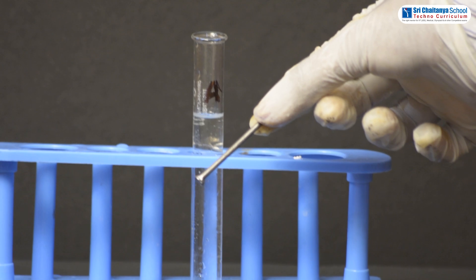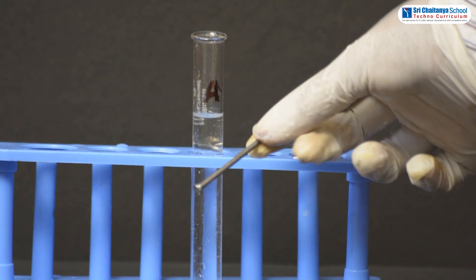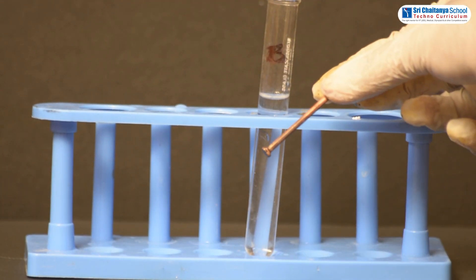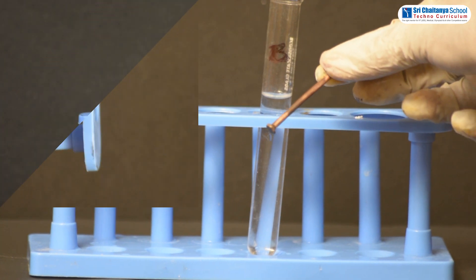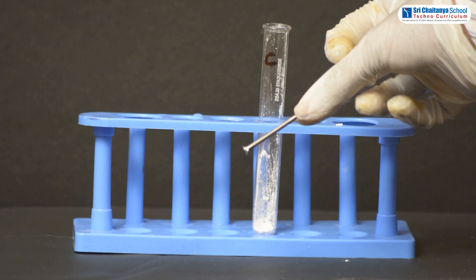In test tube A, iron nail does not rust. In test tube B, iron nail rusts. In test tube C, iron nail does not rust.